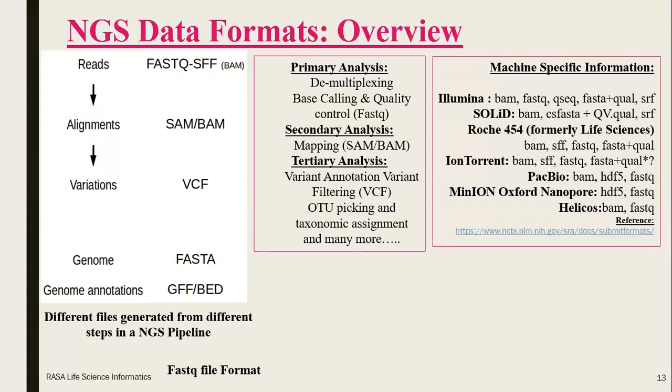Now, these barcode reads and the cell-free DNA reads are written, or converted, to different FASTQ files, and there are various tools for that. Then different sequencing platforms will produce different file formats, and there are tools again to convert them for their respective analysis.